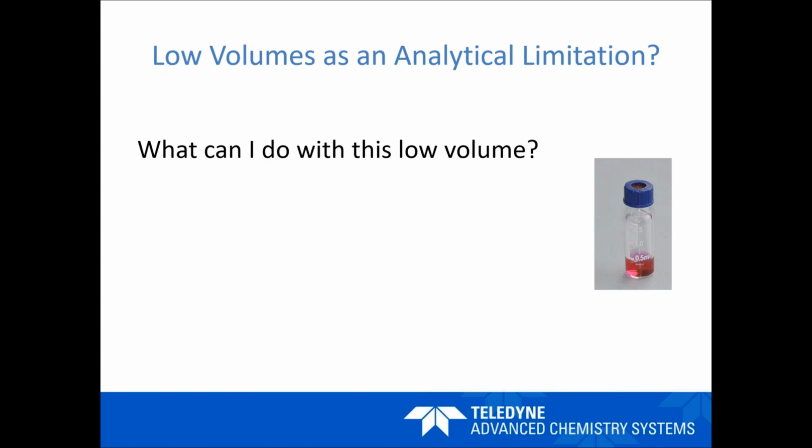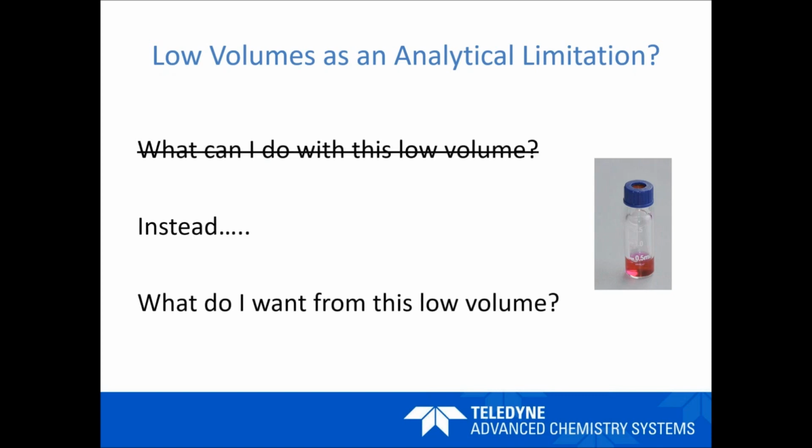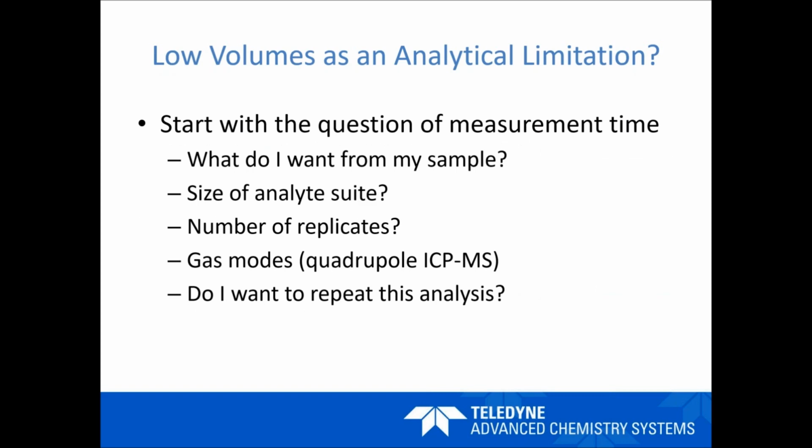I think that the better question is this one, which is, what do I want from this volume? Not focusing on the volume as such, but what do I want from the process? What do I want to get out of it? So I think you go from that and you start questioning, you start picking it apart, and you look at this, and really this is a question of measurement time. So how much measurement time can I get from a sample to generate data from? So that's where I would start with this kind of discussion.